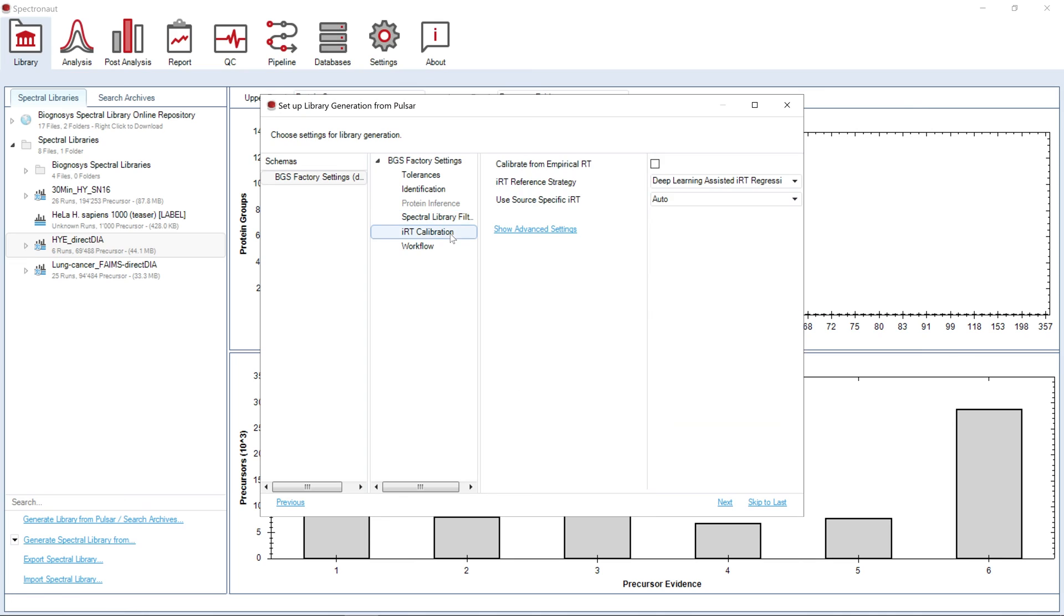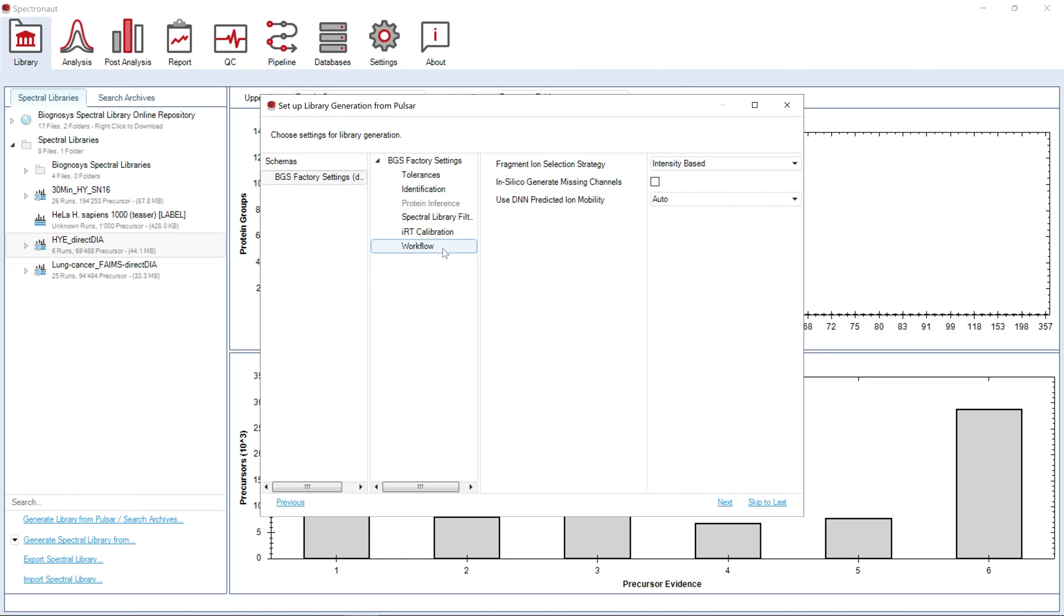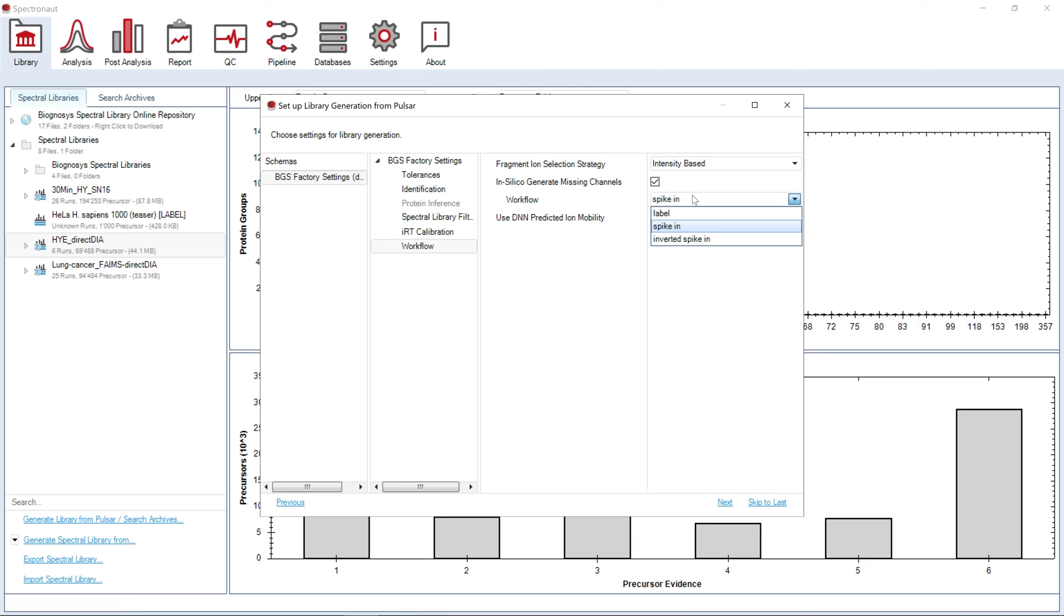For the iRT calibration, Spectronaut will use deep learning assisted iRT regression, where the deep learning algorithm is used to generate the iRT reference set. If you have labeled samples, we would highly recommend using the option to in silico generate missing channels according to the labeling strategy of your experiment.